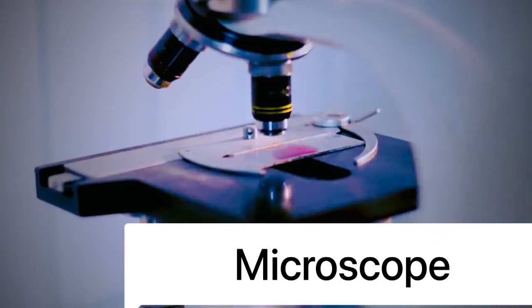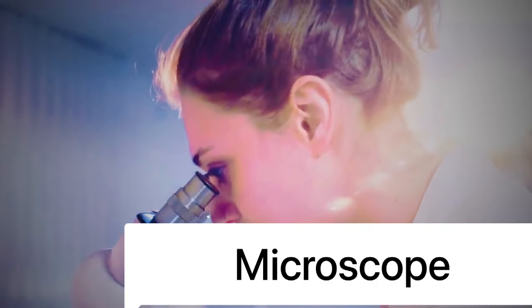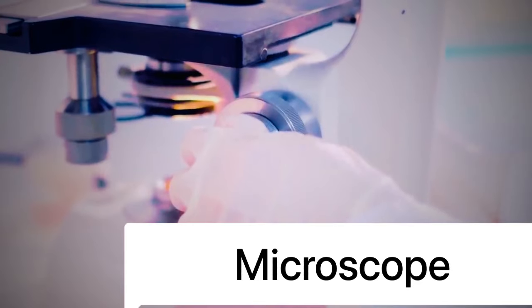Microscope. Microscopes help scientists study microorganisms, cells, crystalline structures, and molecular structures. They are one of the most important diagnostic tools when doctors examine tissue samples.